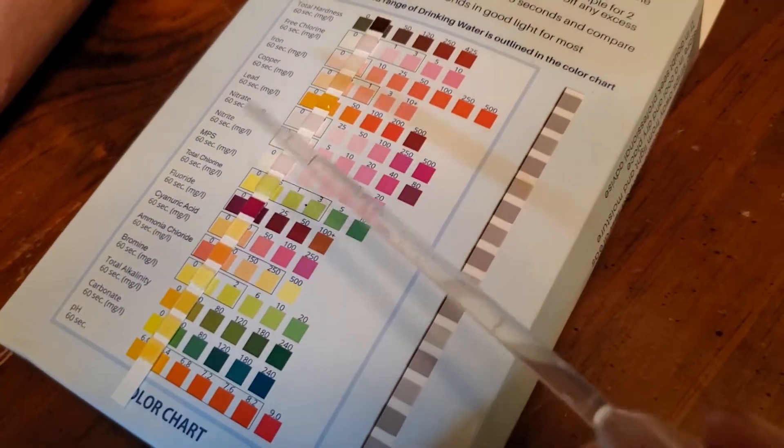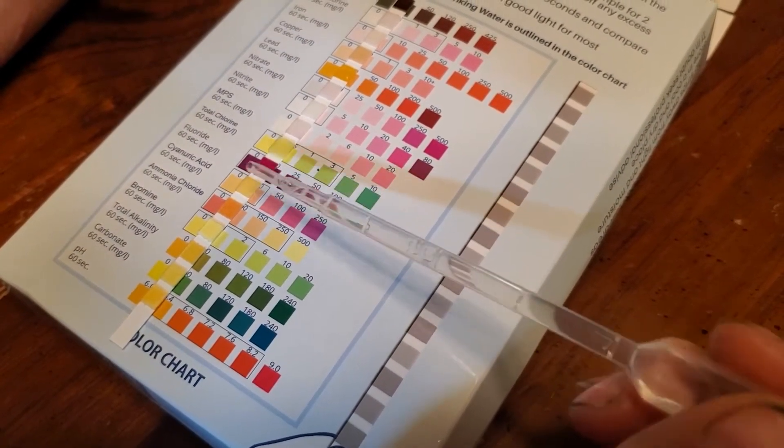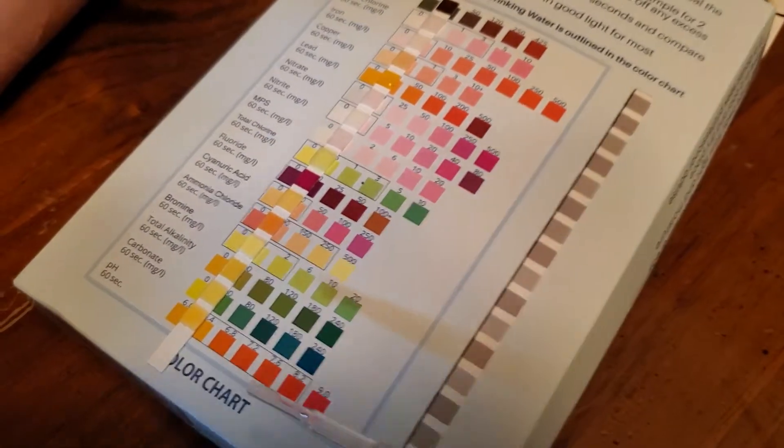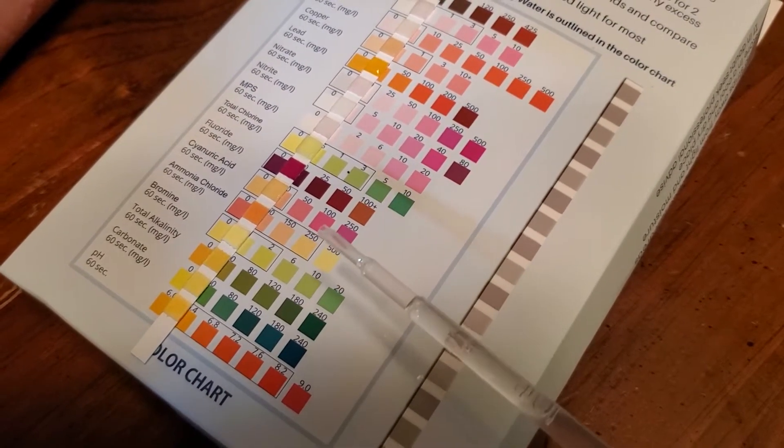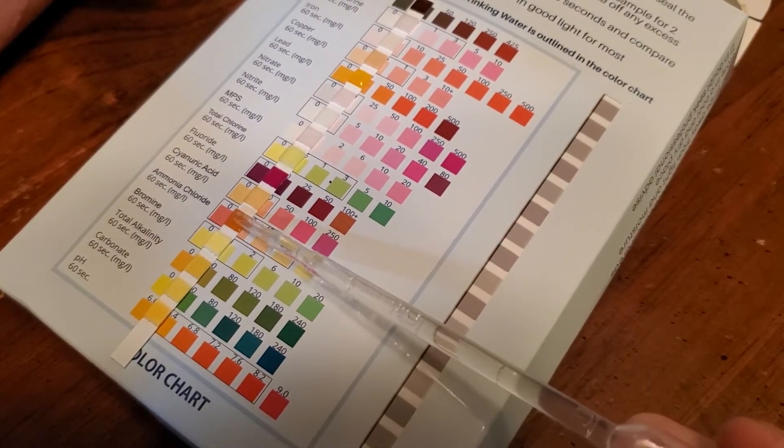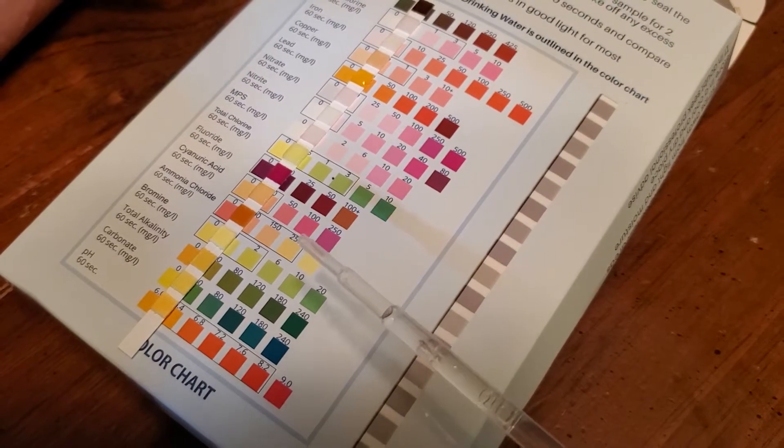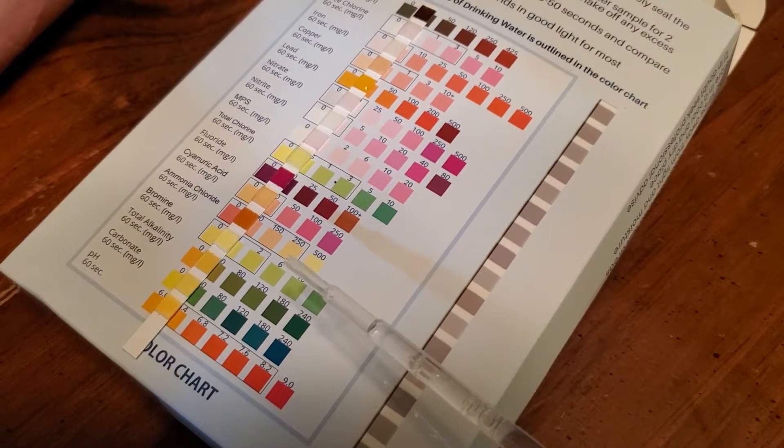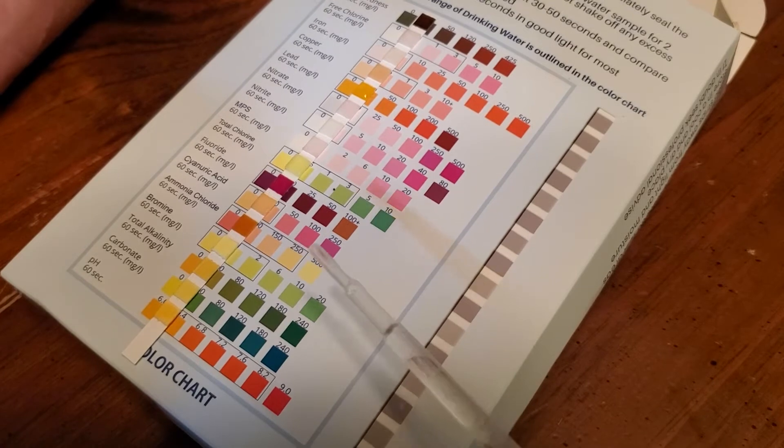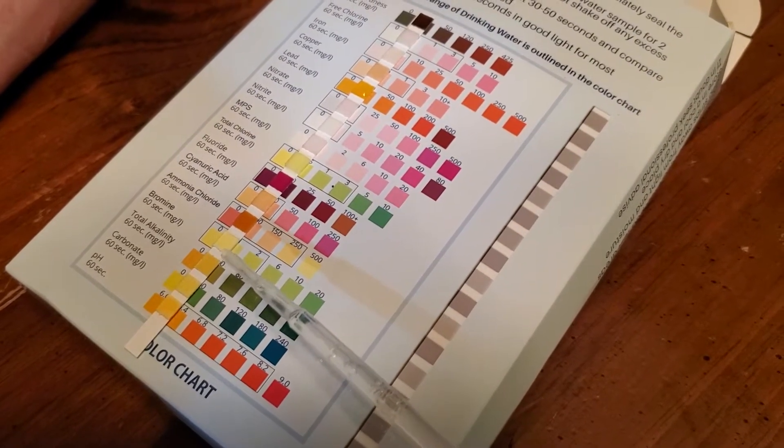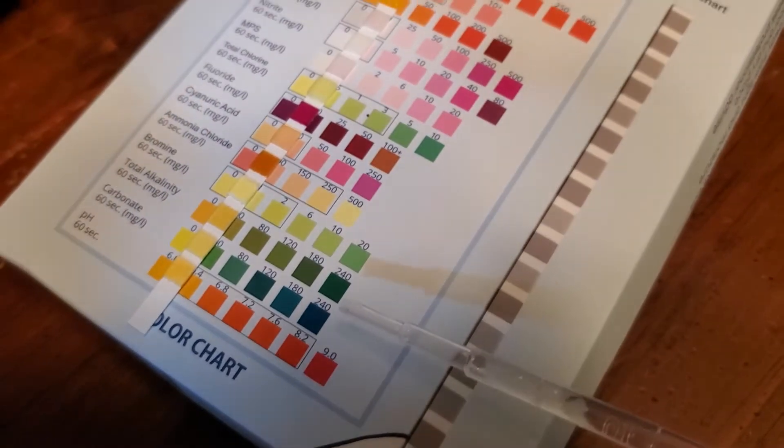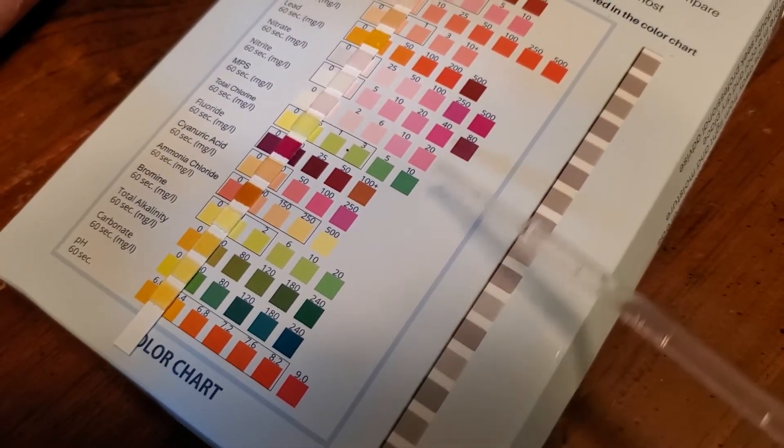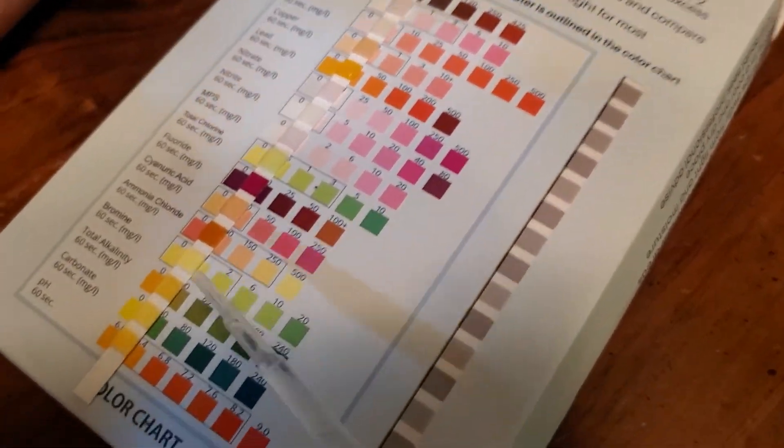Cyanuric acid. Looks in the healthy range I guess. Ammonia chloride. Ammonia and bleach, what a fun combination. That's healthy, it's really dark. But darker is better in this one. I really hate the lead one, that still pisses me off. Well you see and now that it's sat longer it actually seems to be at the zero, which is weird. It's supposed to get darker as it sits longer. The hardness seems to have gone up to them, but it'll go up as it sits, that's normal.